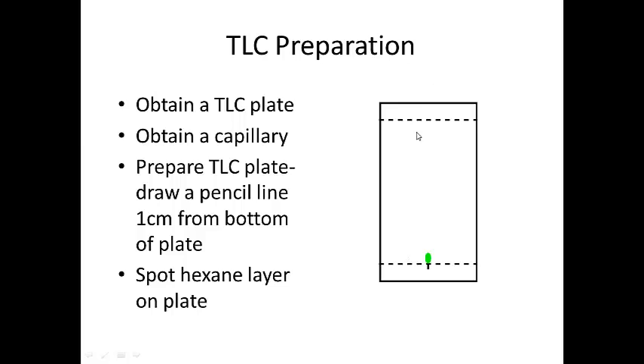To prepare your TLC plate — it'll be pre-cut so you don't have to cut it — you get a TLC plate and a capillary. The capillary is used to spot your compound onto the plate. You want to put a one-centimeter line at the bottom of the plate, then place your spot just above that line. The best way to do it is to press the capillary down onto the spot and blow as you're pressing to evaporate the solvent.